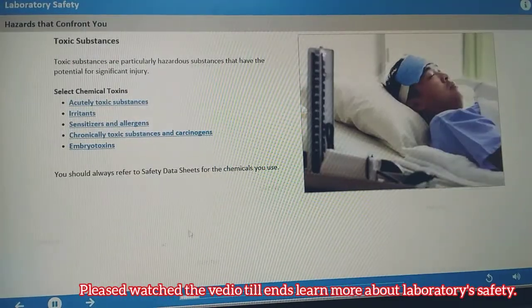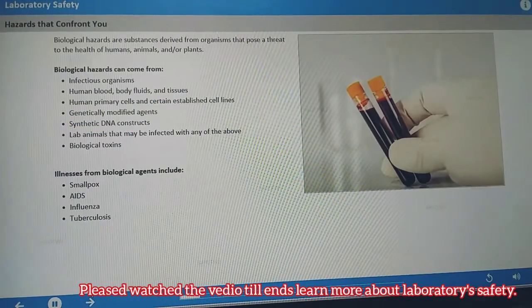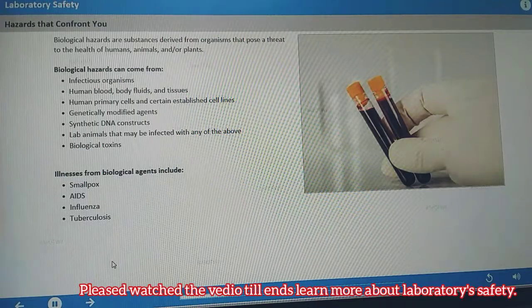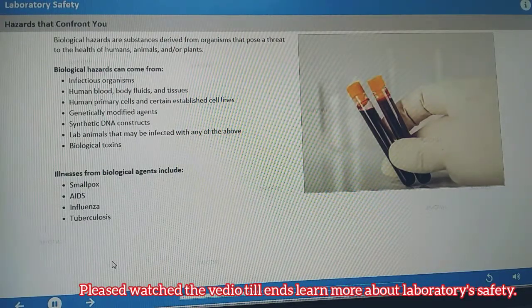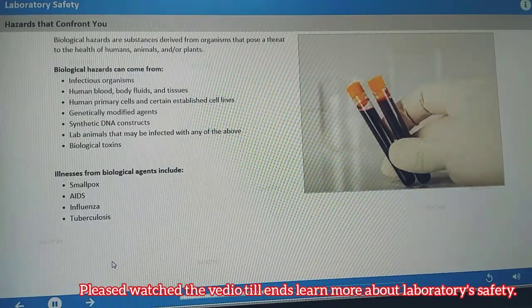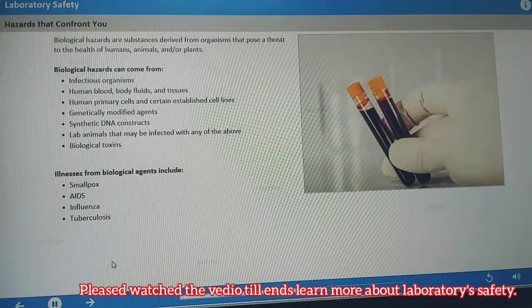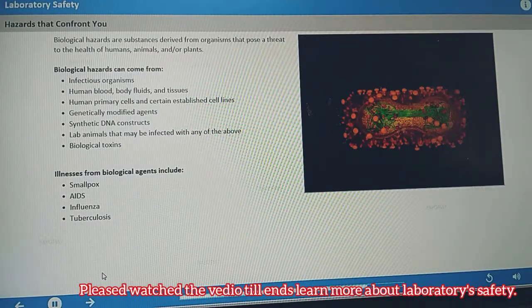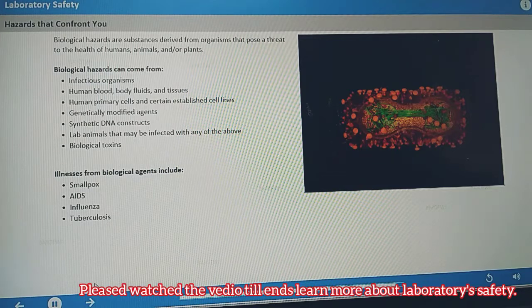Toxic substances are particularly hazardous. Biohazards are substances derived from organisms that pose a threat to the health of humans, animals, and/or plants. Biological hazards come from a variety of sources. They include infectious agents, toxins, human blood and body fluids, organs, tissues, and cells from humans. Smallpox, AIDS, tuberculosis, and influenza are examples of the many illnesses caused by biological agents.